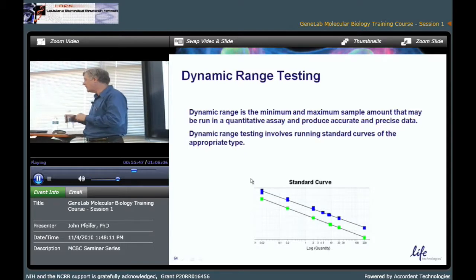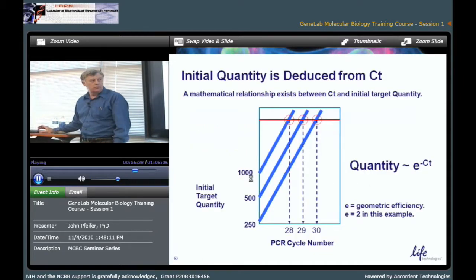When we use the threshold and compare that to using, say, a standard curve with known amounts of plasmid with serial dilutions or known amount of amplicon with serial dilutions to determine the absolute number there, okay. There are methods where some people use the absolute number to determine copy number, whereas there are some where there is a comparison used based on cutoff, where it crosses the threshold, where the curve crosses the threshold cycle.